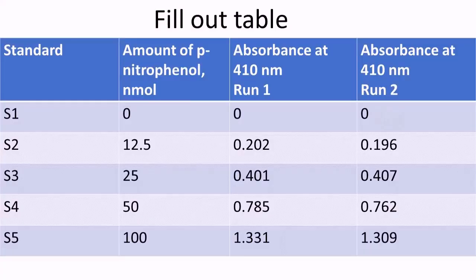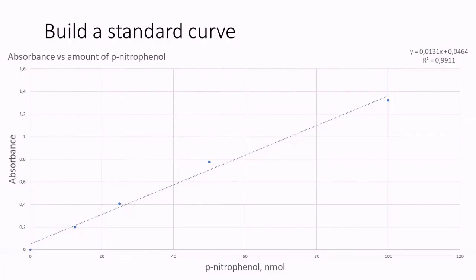Here you can see the table of the results and the standard curve. You will need to write it down into your lab book.